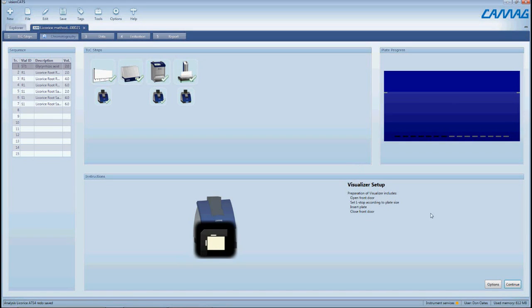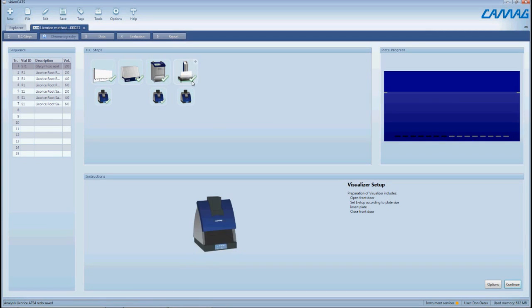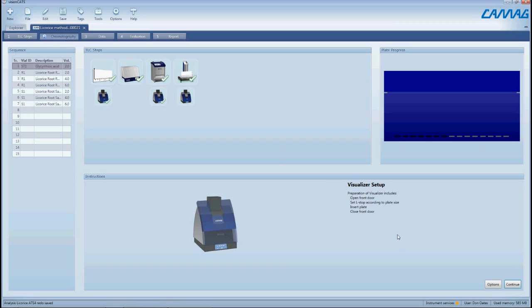Now after we have derivatized the plate, as you can see here that step is now checked, we're going to go to the last step which is to acquire images after derivatization.